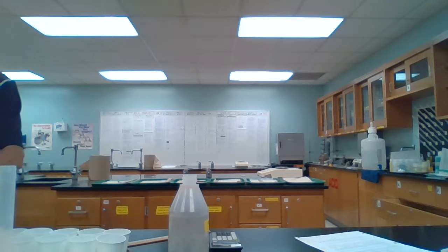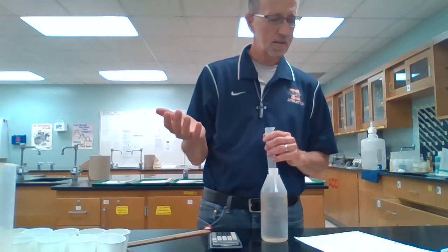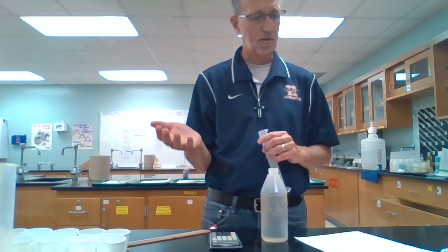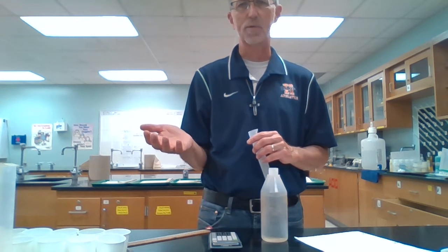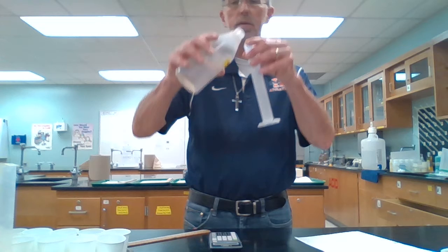Which seems a bit odd, but that's what it says. I guess it's not too different. 32.31 in number 2 was 5.0 mLs, and 34.61 is also 5.0 mLs. That seems reasonable within limits of error. So now we're to number 4.